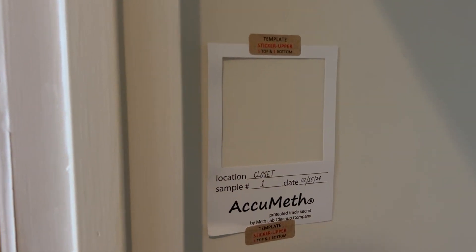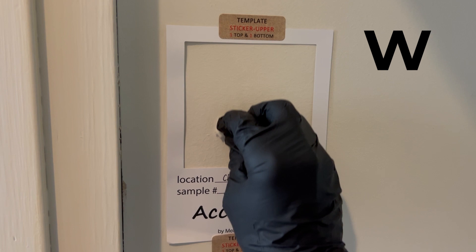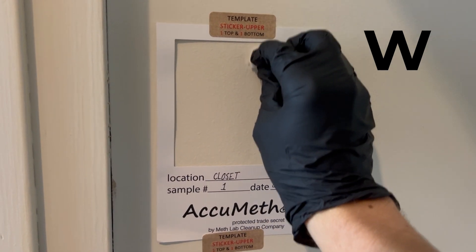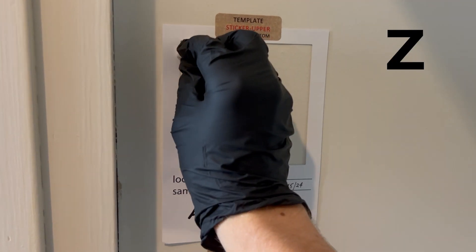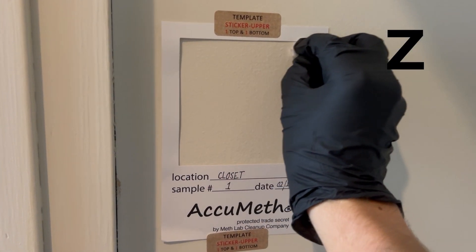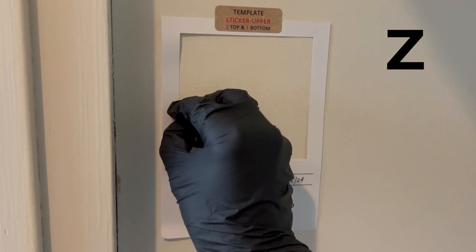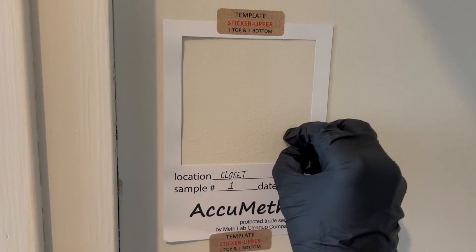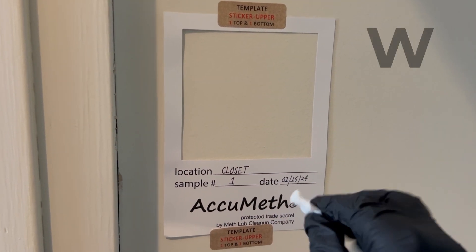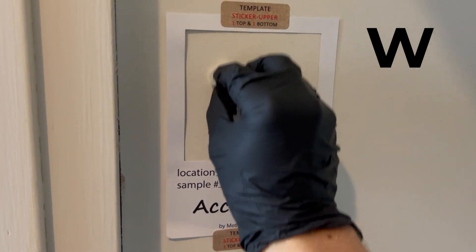Wipe the test surface within the area of the template in a tight zigzag WZW fashion. For the first wipe, we are going to move up and down in a W style. Then for the second wipe, we are going to move from side to side horizontally in a Z fashion. And for the last pass, we're going to turn the gauze over and again move it in a tight up-and-down W fashion.